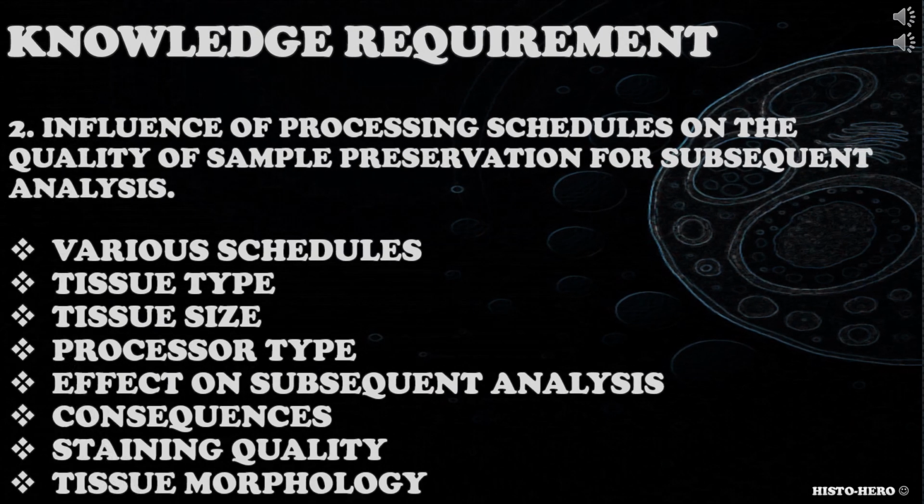The second knowledge requirement is influence of processing schedules on the quality of sample preservation for subsequent analysis. Candidate needs to have the knowledge and understanding about the effects of processing schedules on quality of sample preservation.